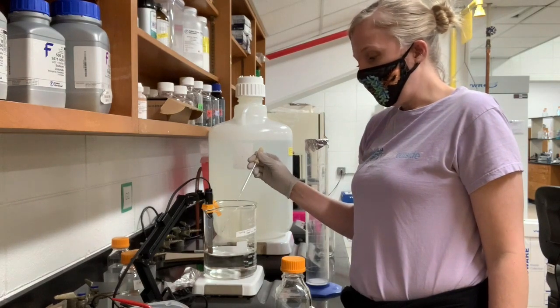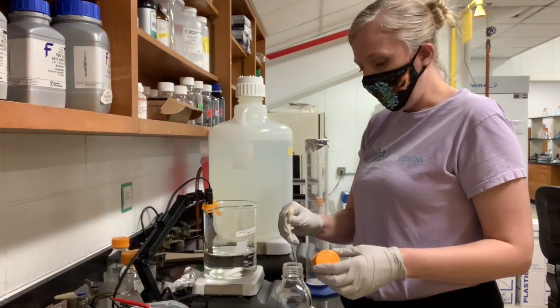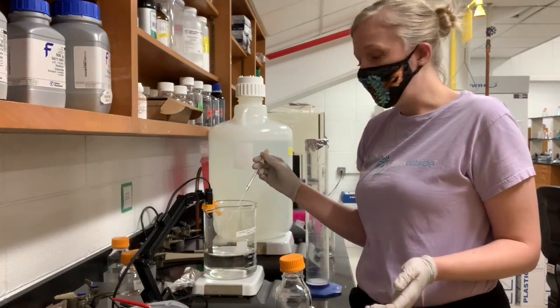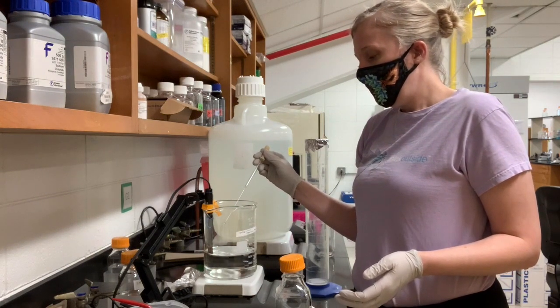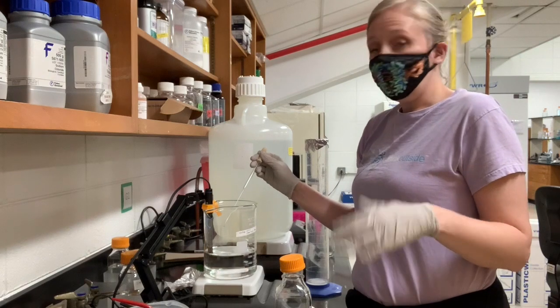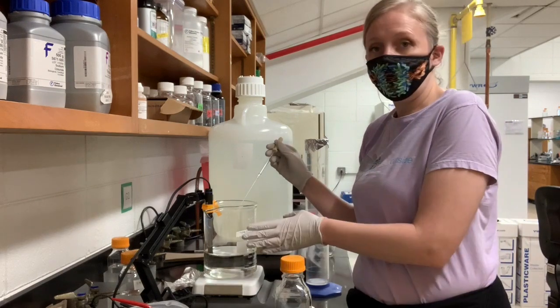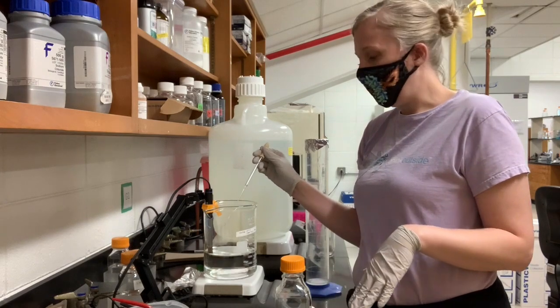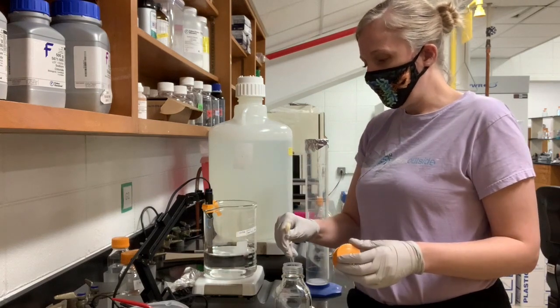The other thing I want to mention while I'm doing this, because this will take a minute, is that I've labeled this beaker. That may not be so important if you're just making one solution at a time, although you could run into a problem where someone else in the lab is also making a solution. But often you'll be making more than one thing at once. And you may think you'll remember that the solution on the left is this and the solution on the right is something else. But if you move something, then you may forget which is which and you would have to start over. So I always label the beaker before I start. I keep the beaker with the solution and then move the label to the bottle when I'm finished. So I'm at 7.04.